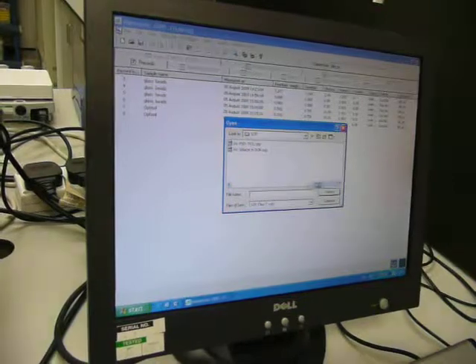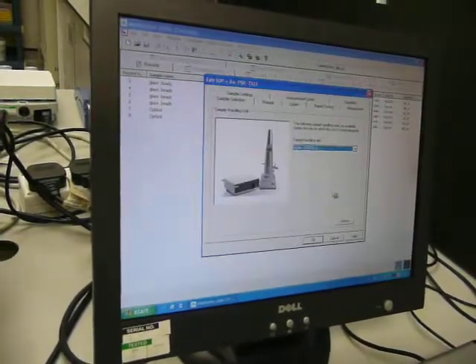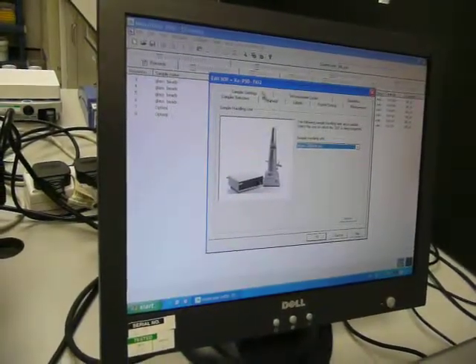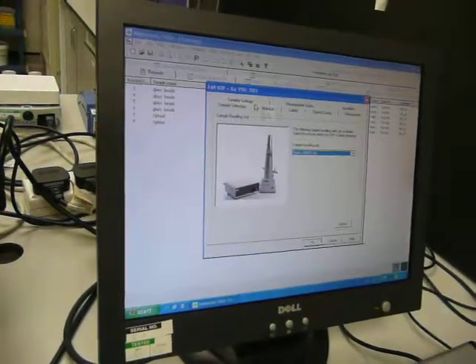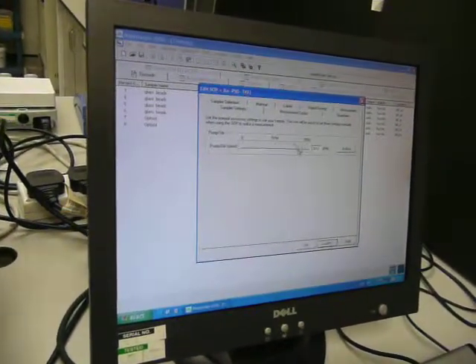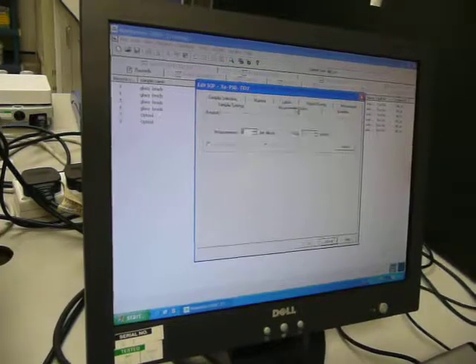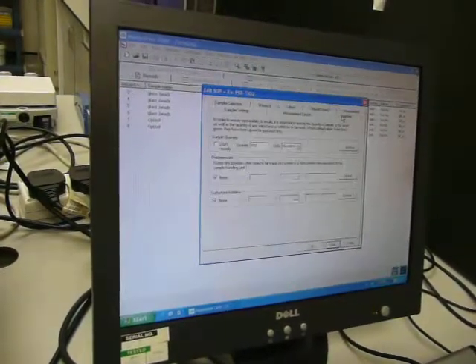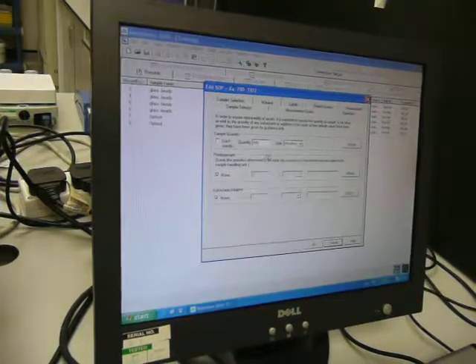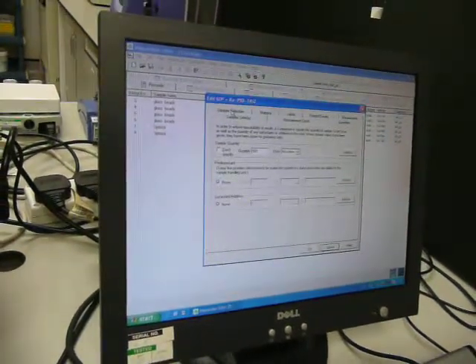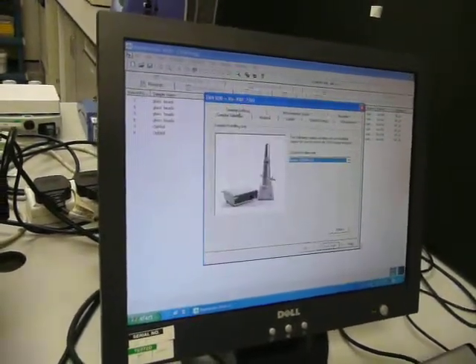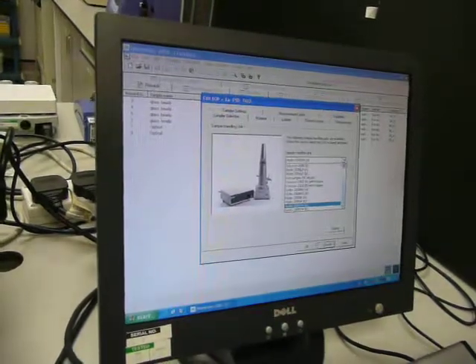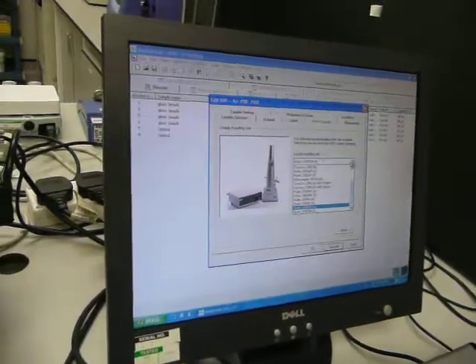And then this is OP, which you can modify, which one you use. You can modify the sample setting, the sample call, the quantity, and also all of this. You select which one you're using for your measurement.